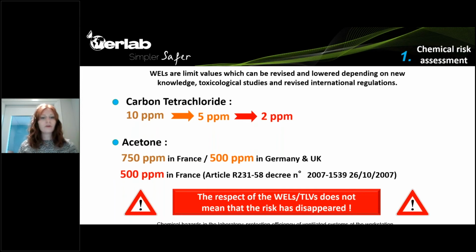For acetone, it's the same. In the past in France we had a workplace exposure limit value of 750 ppm, and now it has been lowered to 500 ppm due to a new decree.